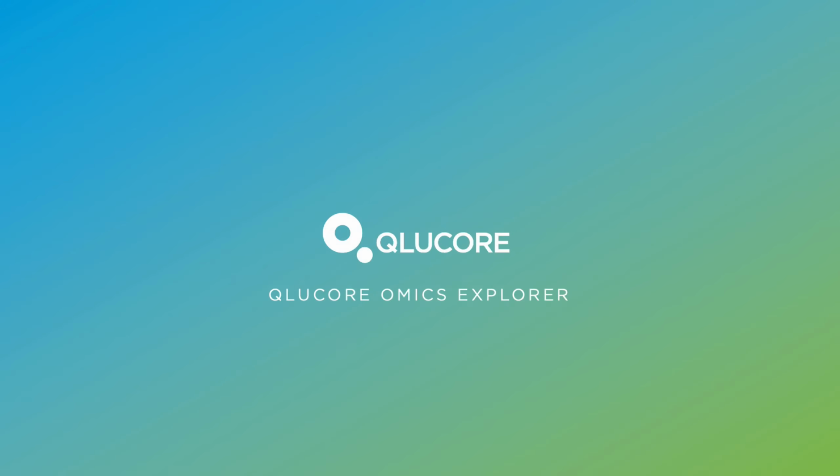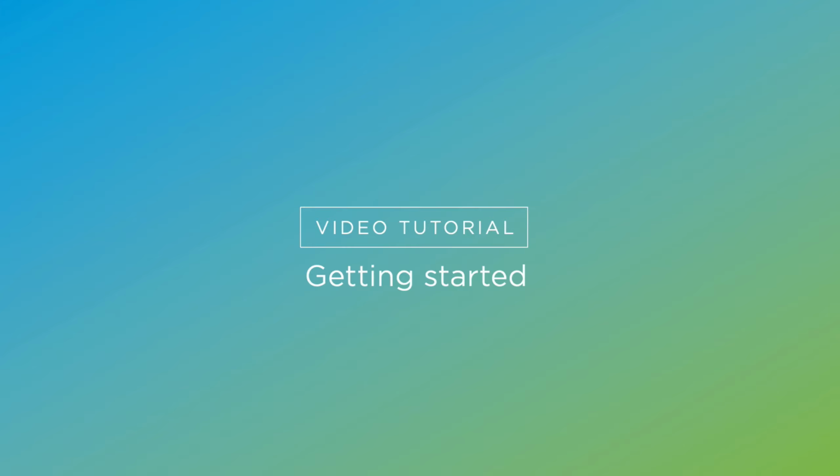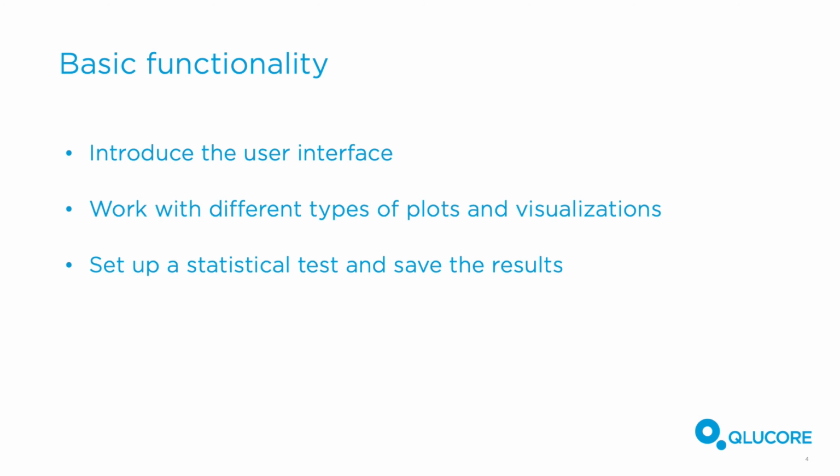Welcome to Qlucore Omics Explorer. In this tutorial, we will introduce the program and show some of the basic functionality to help get you started in the best way. We will introduce the user interface, work with different types of plots and visualizations, and show how to set up a statistical test and save the results.